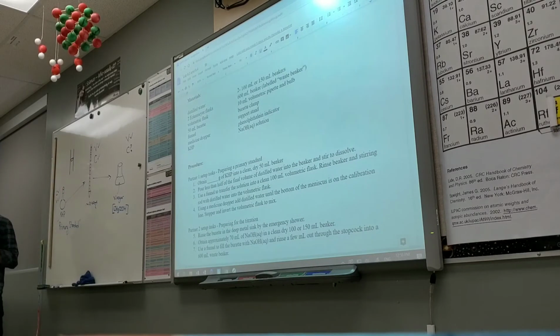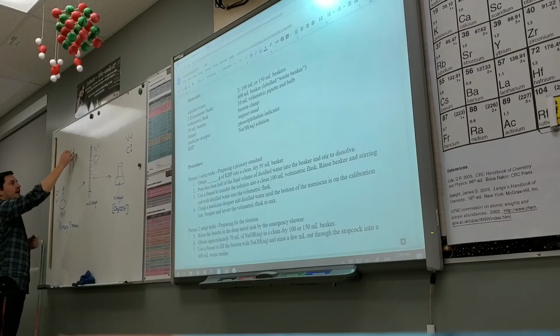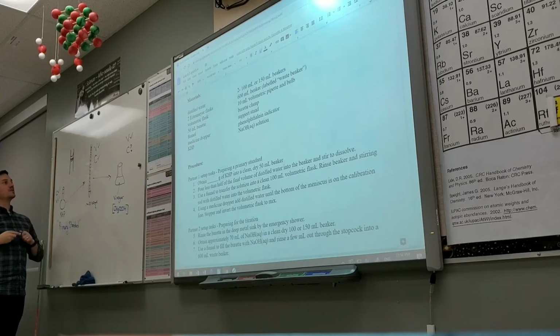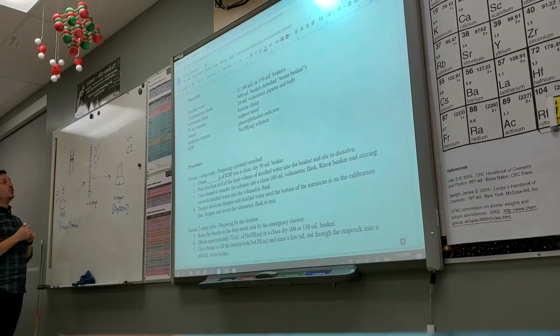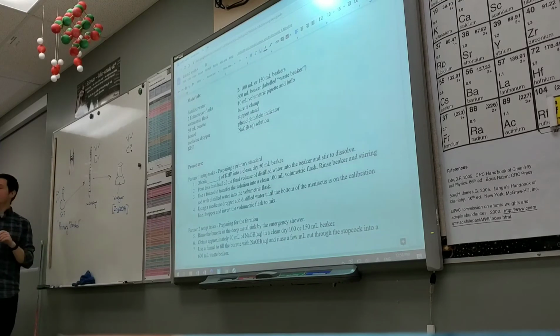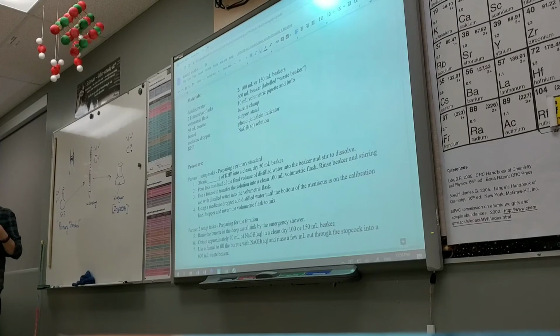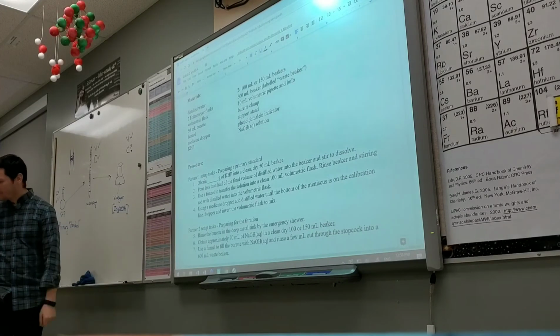is that good? No. Is that good? No. Is that good? No. What happens if you do that? You literally have to start all over again, right? Make sure you do not do that. You want to stop so that the meniscus is just touching the top of the line. That's the idea, right? You want to make sure that it's just touching the top of the line.